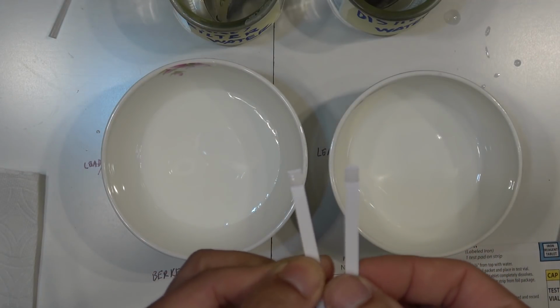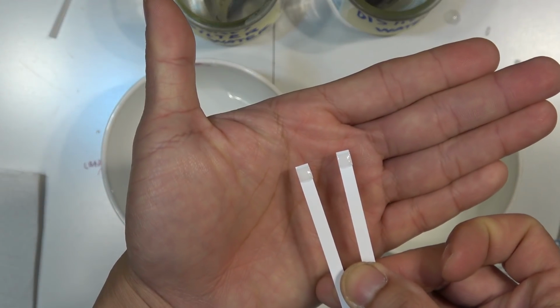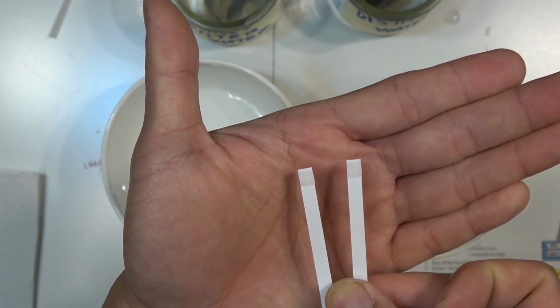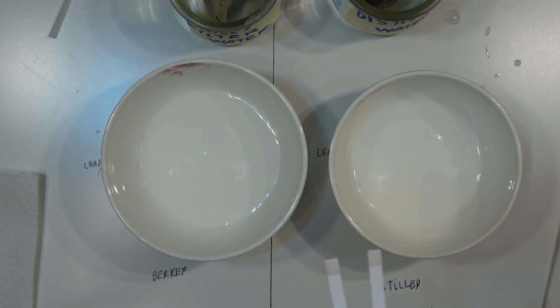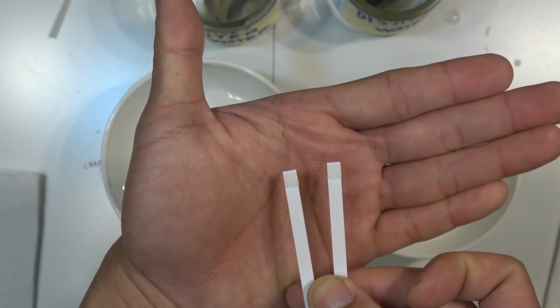And it has been about 15-20 seconds. It looks white to me. So there's absolutely no iron in this sample, in either the Berkey or the distilled water. There is no iron.